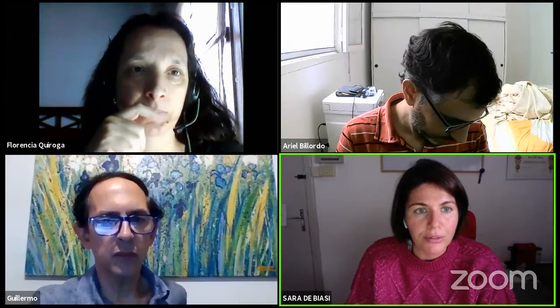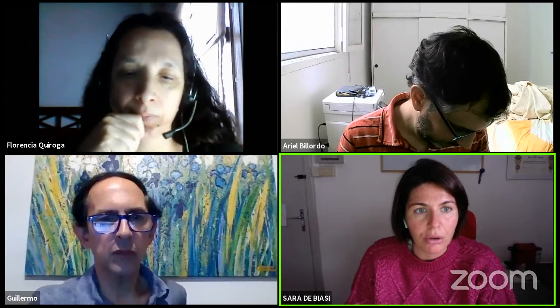Very clear. Thank you very much. Thank you. Can you tell us, Sarah, what algorithm did you use for trajectory inference in your study? Yes, we use pseudotime, Monocle. Dr. Domenico Tartaro performed the analysis, and he used Monocle. So pseudotime and Monocle. And have you conducted that kind of study in single cell RNA data? Yes. And in flow cytometry data as well?